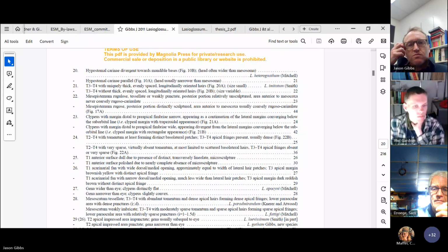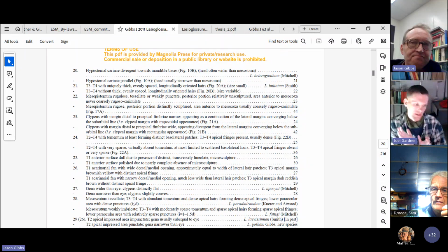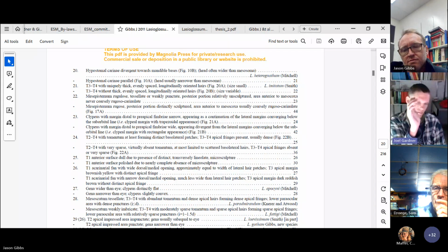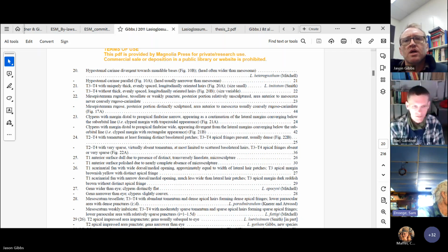Did we talk about with callidum, if the mandibles are closed, that you can still sort of see a different shape on the outside edge? The mandible on callidum will be more sharply angled on the outside edge, even if the mandibles are closed; you can see it's more of a right angle bend in the mandible. I'll try and pull up something like that. And it's the mandible as a whole, I think, that you're referring to, right?